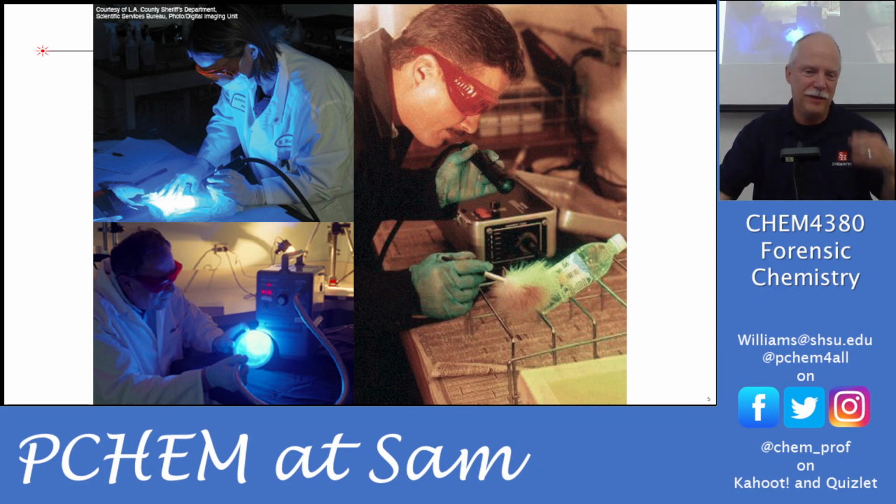So here's some examples of looking in a scene or dusting for fingerprints using alternate light sources. We'll get into exactly what they're doing with the green light and the orange glasses in a minute. But these are some different crime scene lights you see here. A lot of them are fiber optic, so you can carry the little output optics here, but then the power source and the lamp is back here in a box or plugged in. These are very bright, so these are probably laser sources. And laser sources, typically diode laser sources, don't generate nearly as much heat as like a tungsten lamp with filters.